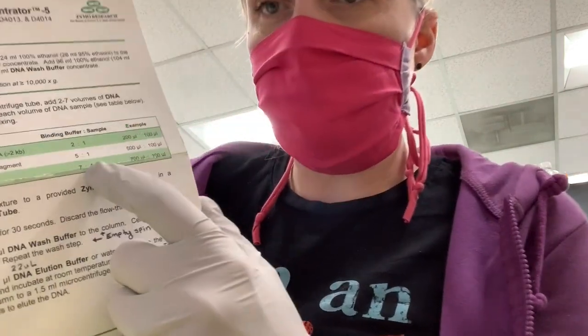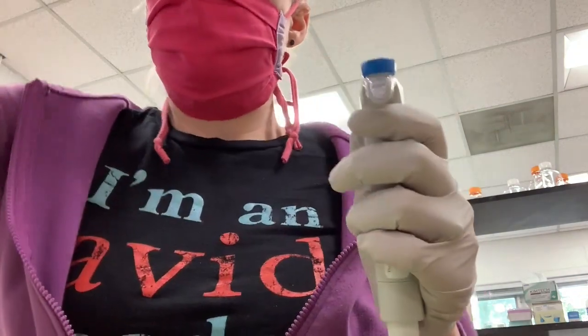The first thing I'm going to do is take my lids off of my PCR tubes. They're in a little rack, and I am going to look at this little chart. I have PCR products, but they're pretty short. So I'm actually going to use the 7:1 ratio and use 350 microliters of the binding buffer per sample. You'll notice when you try this that that's more than will actually fit in a PCR tube. So I'll kind of show you how I do it.